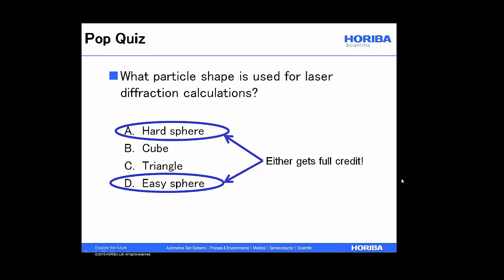That's kind of a risk-based decision. Some quick checks are fairly inexpensive. I've seen pharma outfits that will confirm their instrument performance before every critical measurement. Especially, I'm thinking of one case where they share the instrument with an R&D group, and they're clever enough to know that R&D doesn't always clean the instrument up perfectly before leaving the room, if you will.